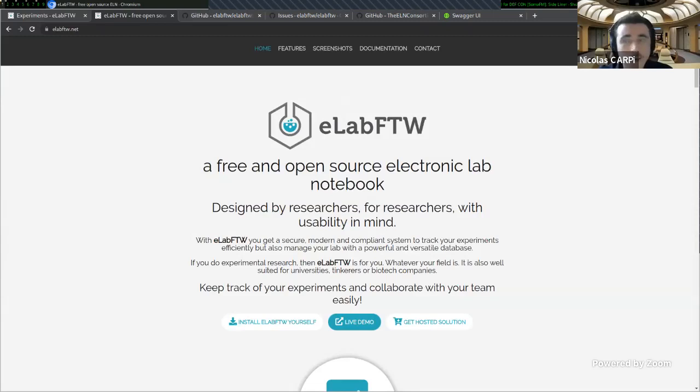And I have 15 minutes to show you as much as I can on the lab notebook. So you have 20 minutes. You have 20 minutes, Nicola.